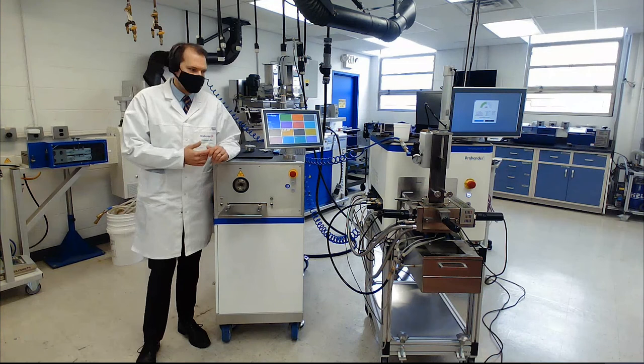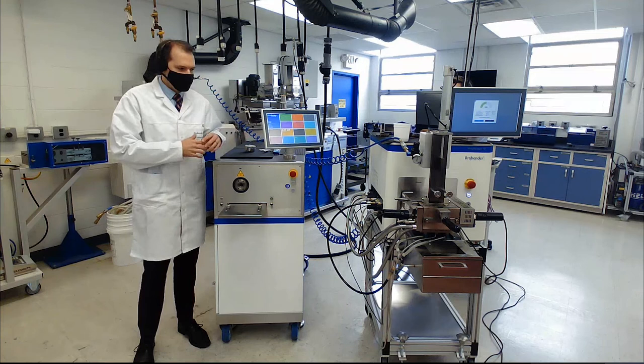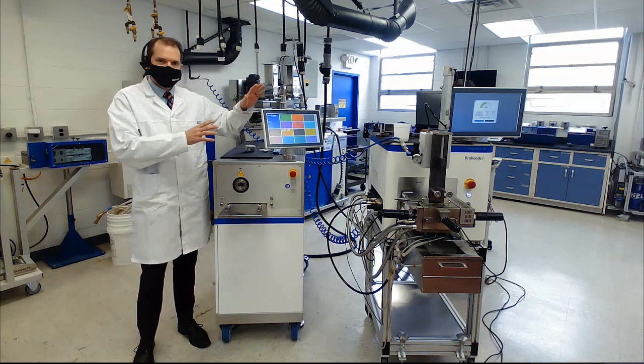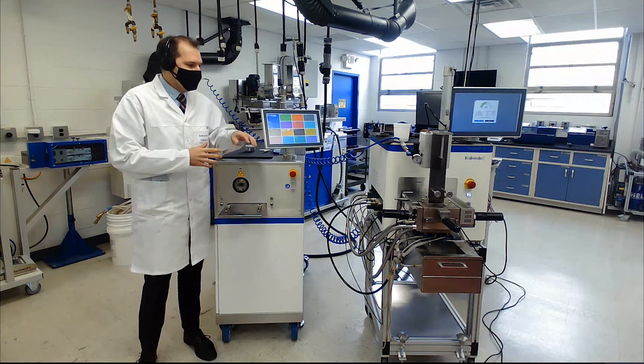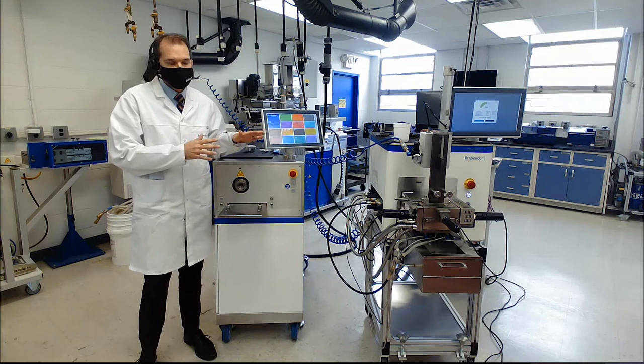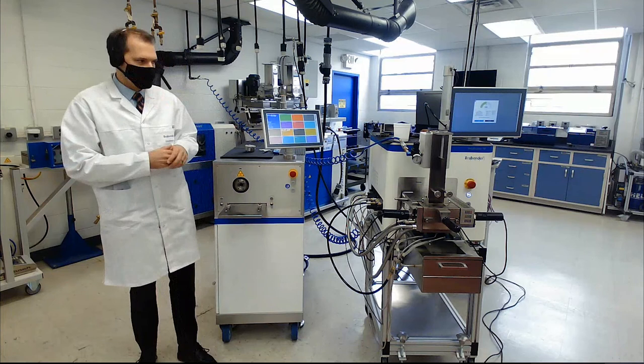I have them both here set up. We have our new tabletop edition as the metastation 4e, which is a 5.6 horsepower motor with 200 newton meters torque at 185 rpm. It has the full capability of having all the attachments that you love and care about, integrated with new safety features as well as six full heating zones with four active cooling zones.